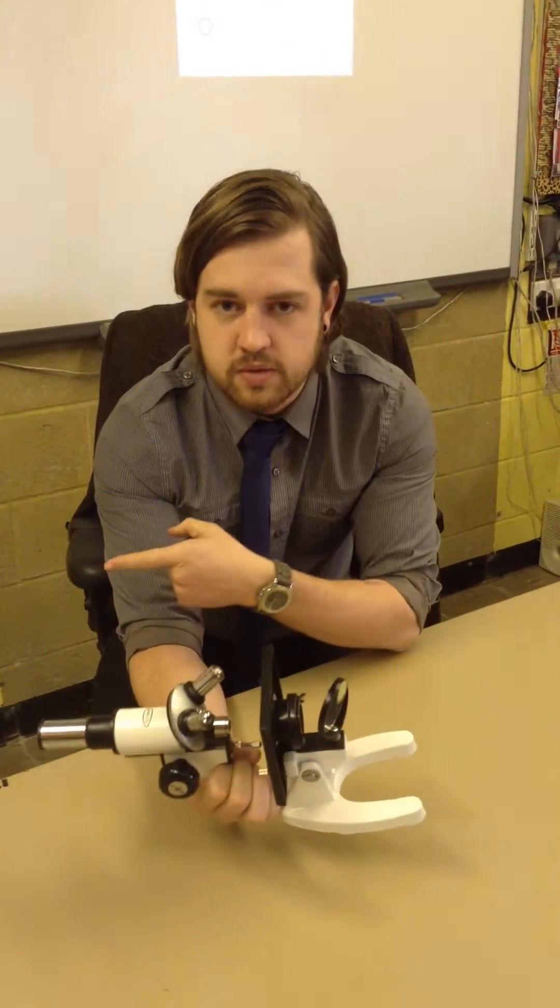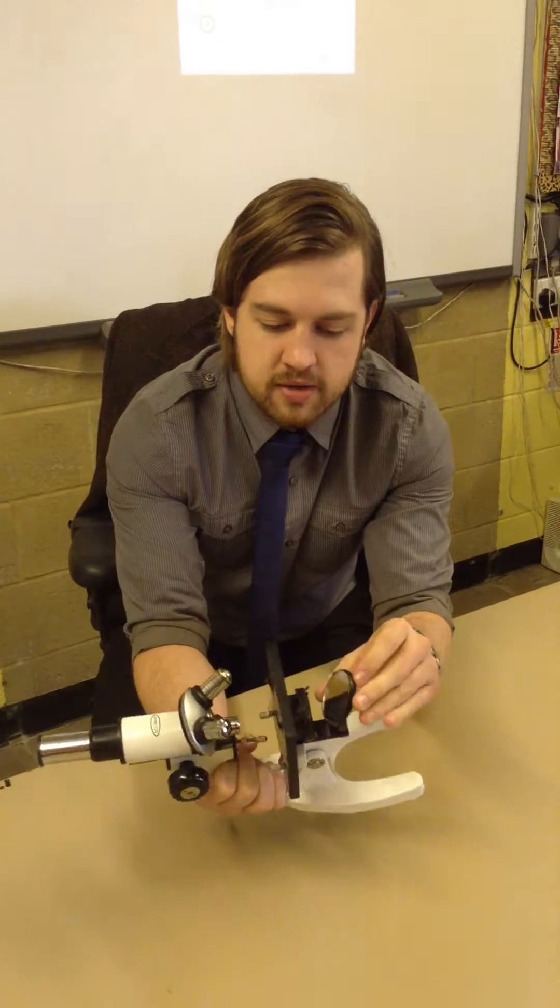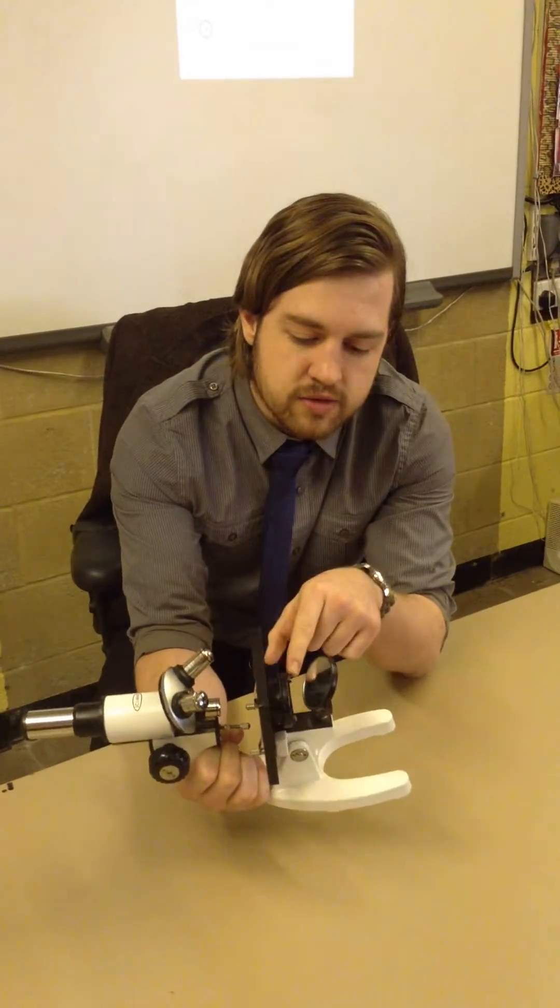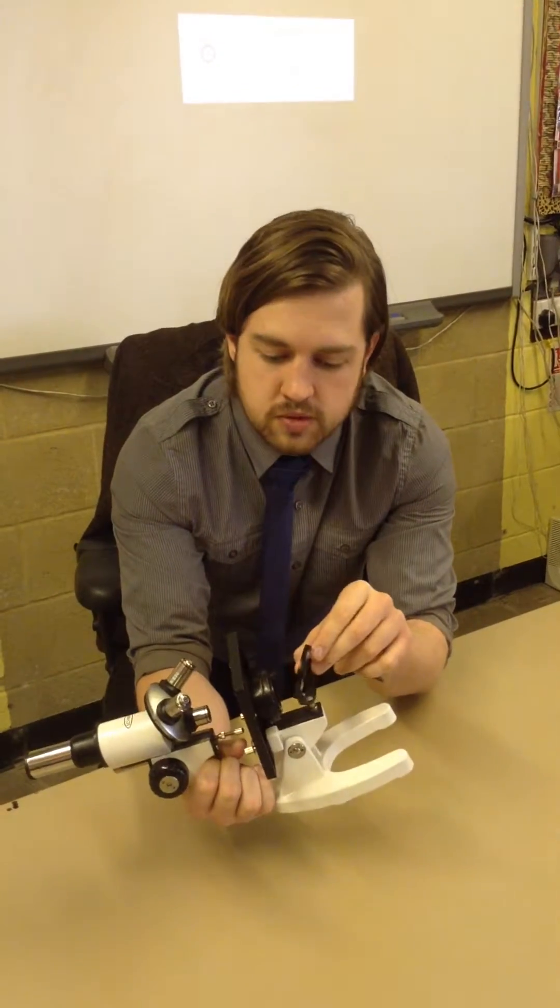If I start from the bottom and work my way up, on the bottom of the microscope, you have a mirror. The mirror is used to shine light through the hole in the bottom all the way up through to the lens at the top so you can see.